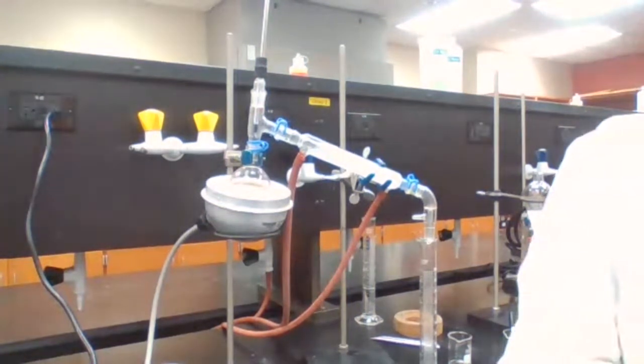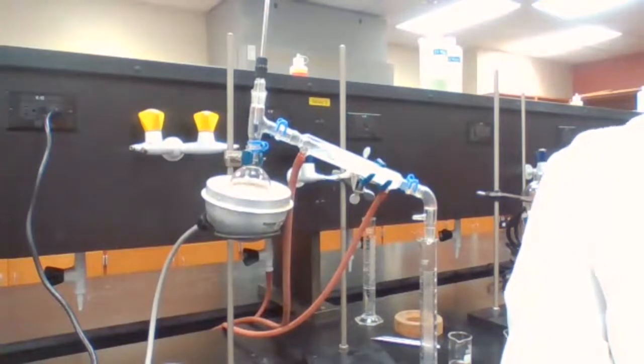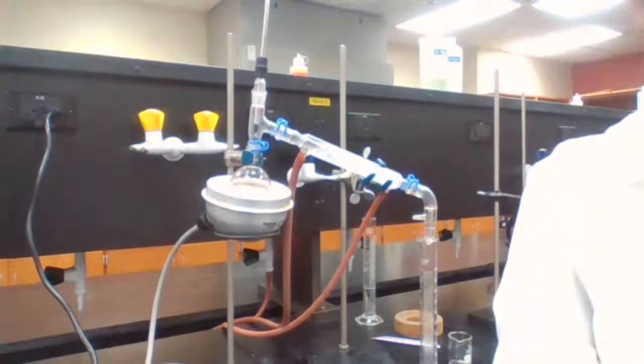So one of the diastereomers here is soluble in methanol, and the other one was insoluble in methanol. So we could actually wash it with methanol.